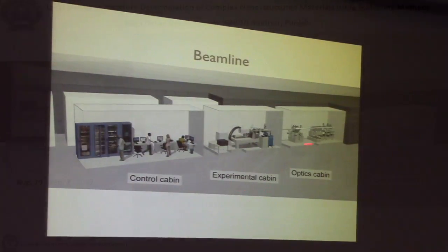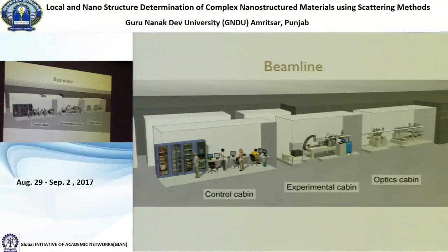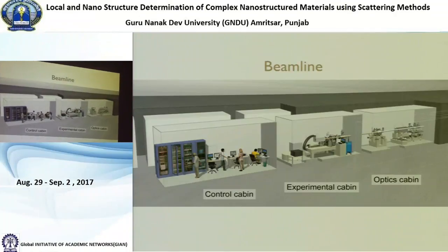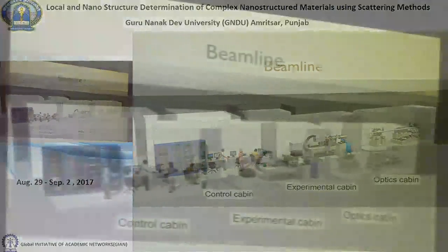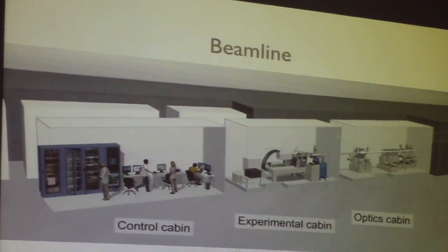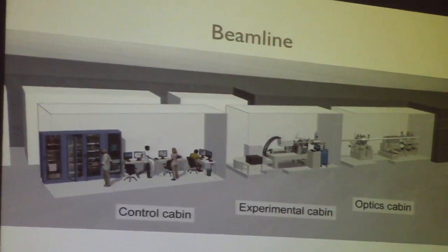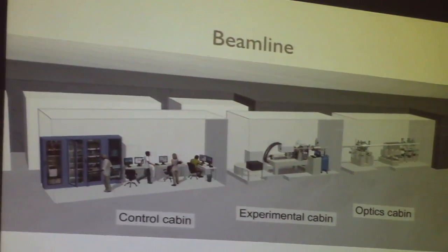This is a little bit what a beamline looks like. I think it's maybe the MAX IV beamline, but the ring is kind of going around here, then there's the hole in the shield wall here, and the X-rays come out in a straight line. Because there's so much radiation that it would kill anything in its vicinity, we make these lead boxes, and we call them hutches, and they're so big that you can walk inside them.